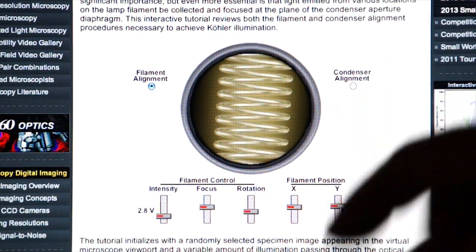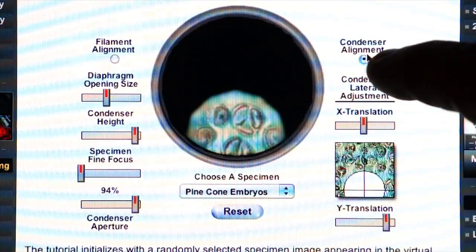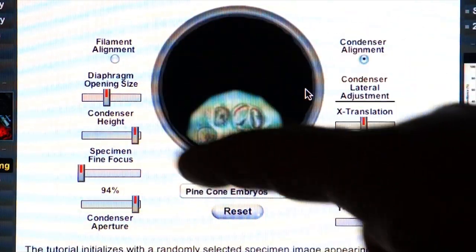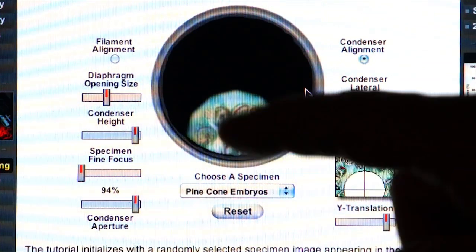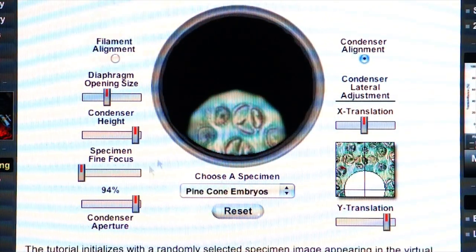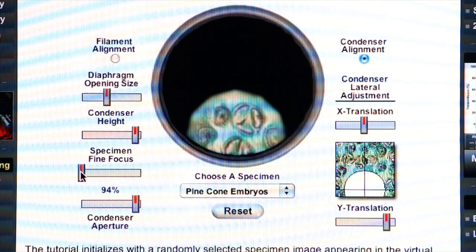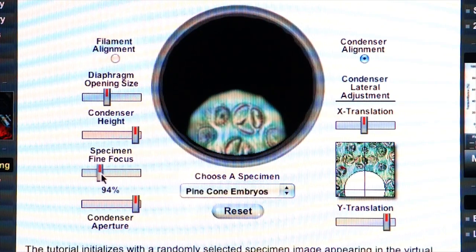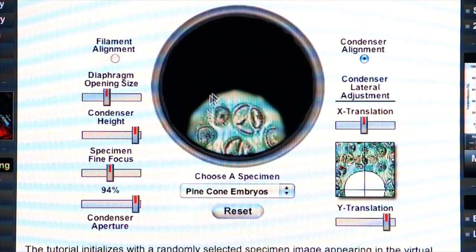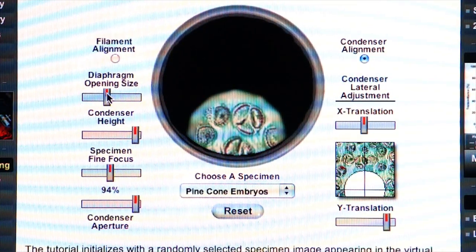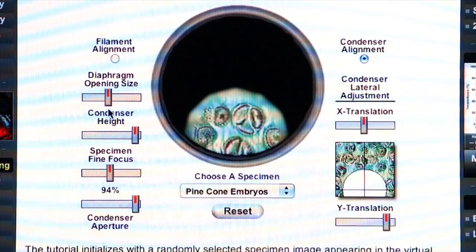Now let's discuss the condenser alignment, because this is how you actually do Köhler illumination. Clicking on the condenser alignment tutorial, you see the field of view in the microscope. The first thing to do is use the 10x objective and get your specimen finely focused. Then close down your field diaphragm until you can see it in the field of view — close it enough so that you can see almost the whole diaphragm.